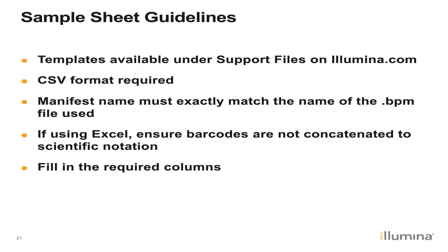Another thing that I'd like to go over is the sample sheet guidelines. So you want to make sure that your sample sheet is formatted correctly so that GenomeStudio can import the information properly. Otherwise, if it's not formatted correctly, GenomeStudio will throw an error. So I'll go over these in more detail in the next few slides.